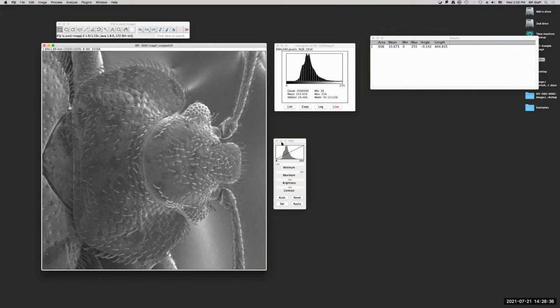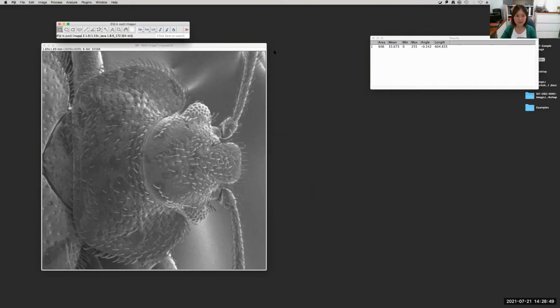Miki, it is a little faster. Okay. So some audience lost how to get the smaller histogram. So can you show how to get the histogram?